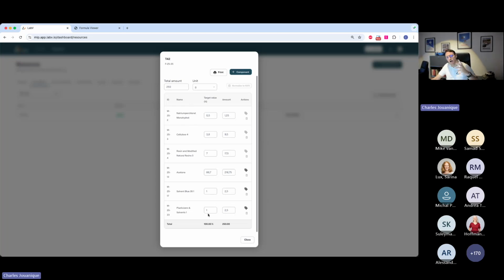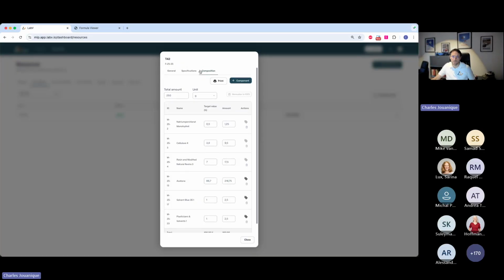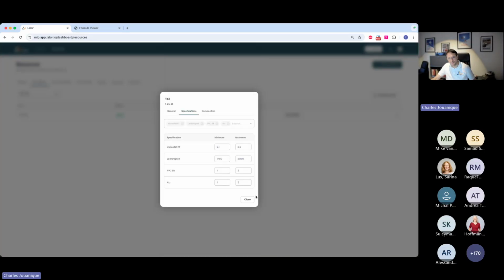So now I have the information, I know what we're talking about, I know that we're very far away from the specifications the customer wants to achieve. What do I do? Well, I'm a trained chemist, right? So I'm trained and I know exactly if you want to reduce conductivity and increase viscosity, you have to work on additives. I'm going to just take one example for today.